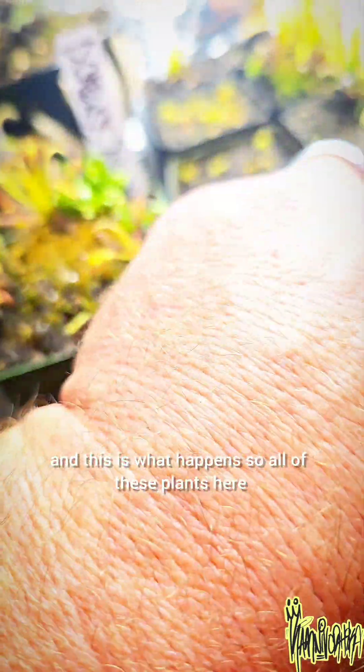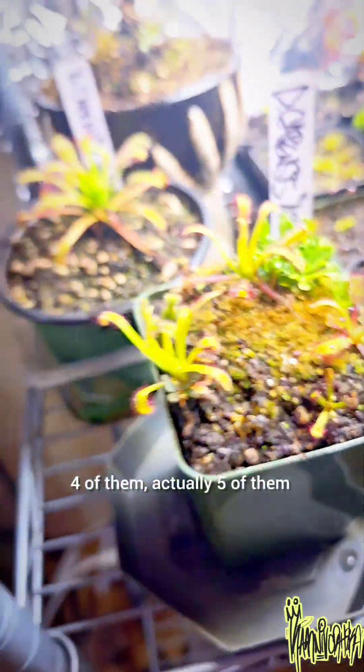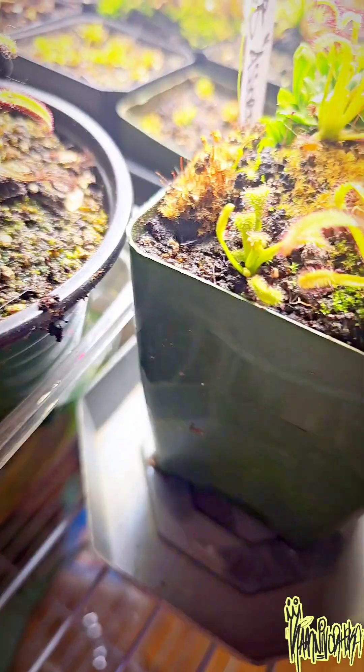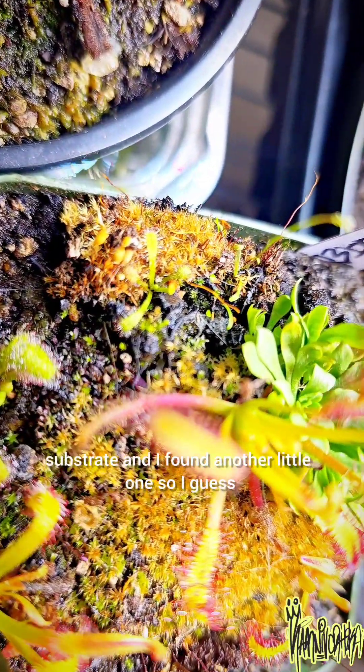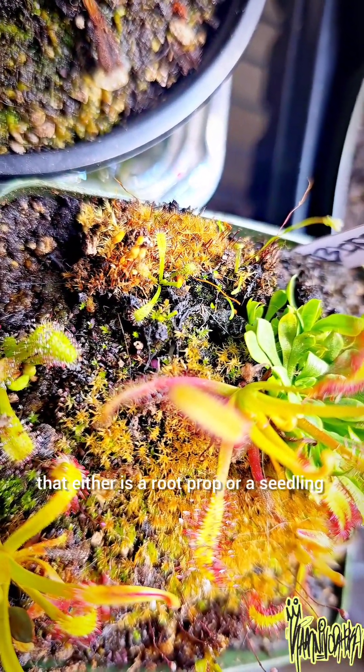All of these plants here were born in one of these test tubes — there are five of them right here. Last night I was digging through some of the old substrate and found another little one, so I guess that's either a root prop or a seedling.